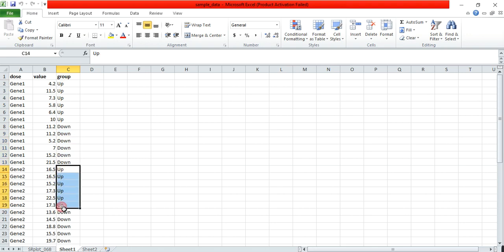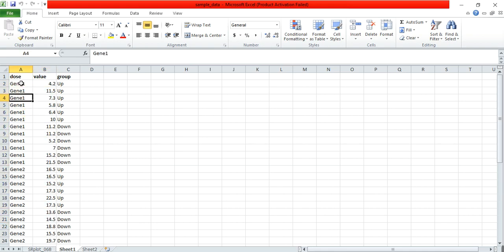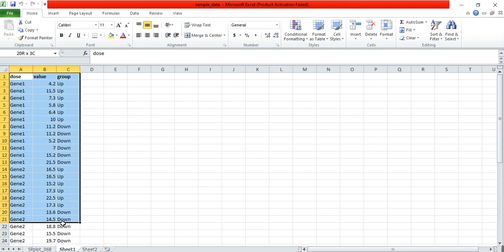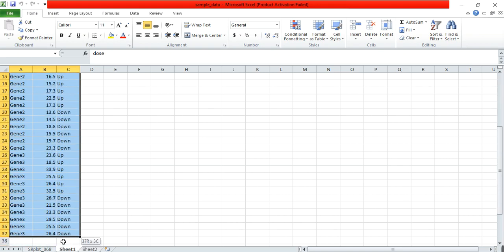Here, it also like this with the gene 2, and these are their expression values. So, I want to make them and show them in the violin plot.